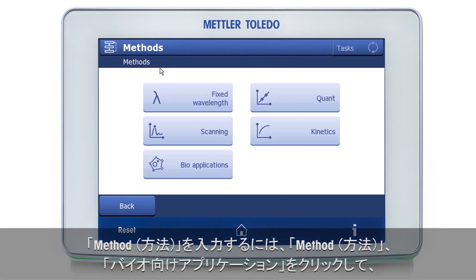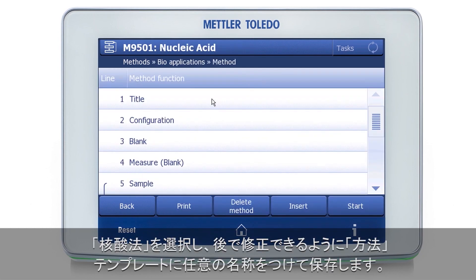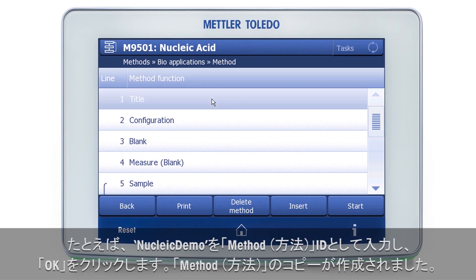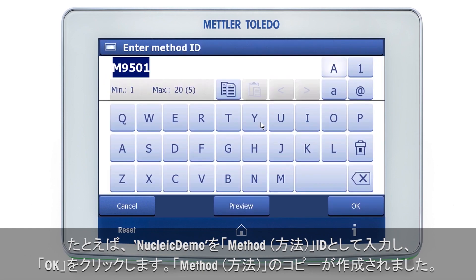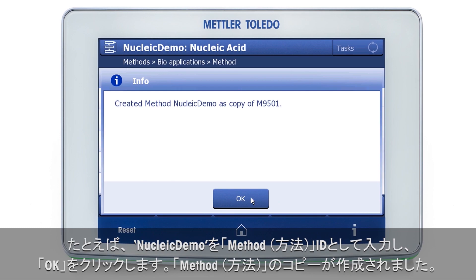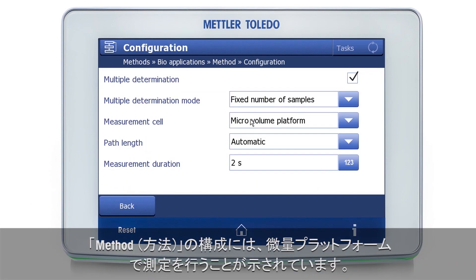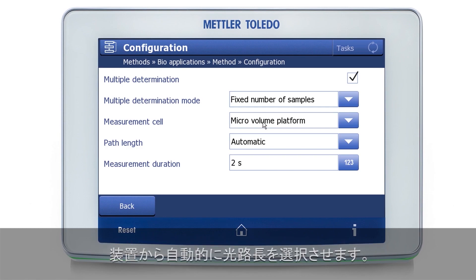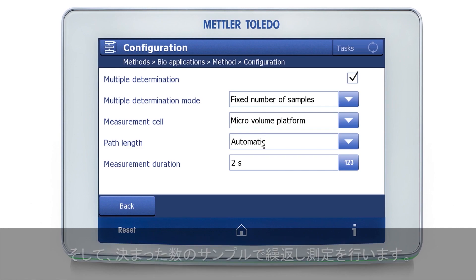To enter the method, I click on Methods, then Bio-applications, and select the nucleic acid method. In the first step, I store the method template under my own name so that I can modify it. I will enter here as a method ID, for example, 'nucleic demo'. I click OK, and now you can see a copy of the method has been created. In the configuration of the method, we will perform the measurement on the micro-volume platform, let the instrument select the path length automatically, and do a multiple determination with a fixed number of samples.